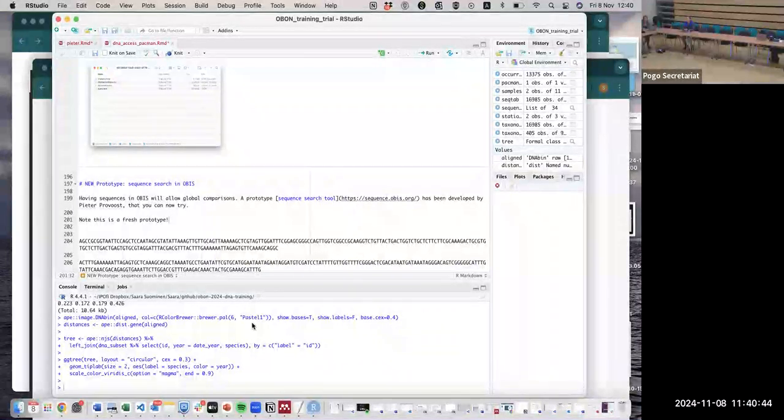One thing I was wondering about for either OBIS or GBIF: we get a lot of contaminant sequences in our data set, especially like 12S, so always human, usually cow, pig, things like that. Should we be uploading filtered data that we have removed definite contaminants from? And then we have possible contaminants, like fish that may or may not belong there. When we have our QC processing for final data, we try to do some of this quality control. Is there some minimum amount we should do, like definitely get rid of humans?